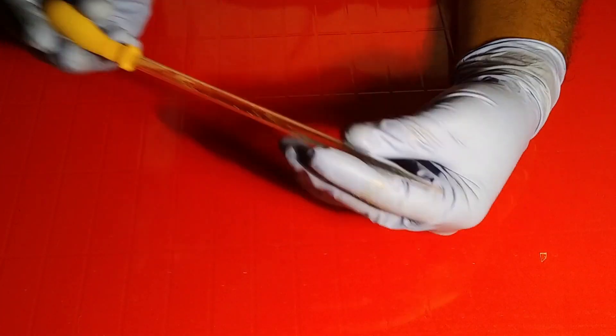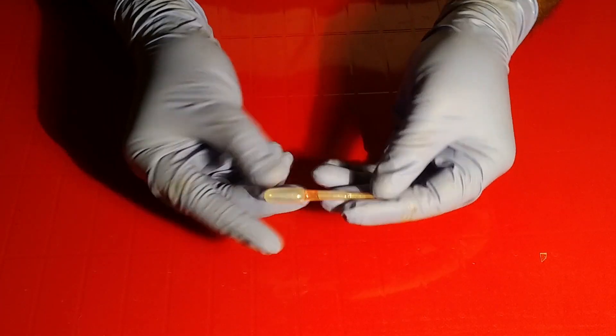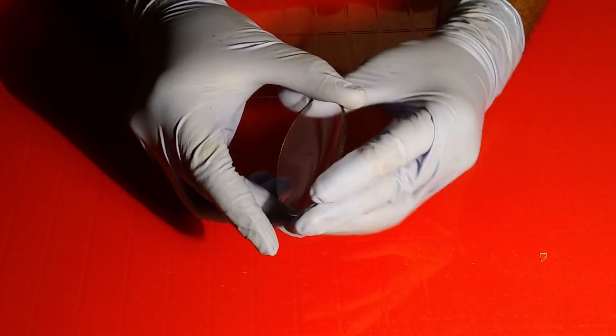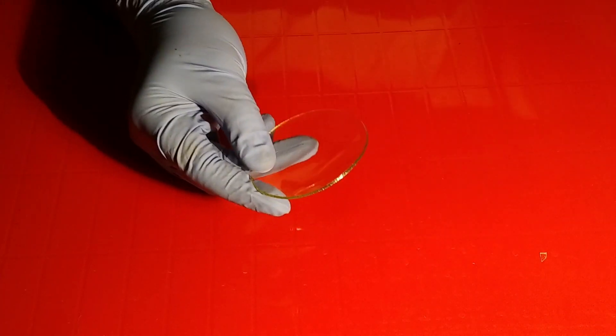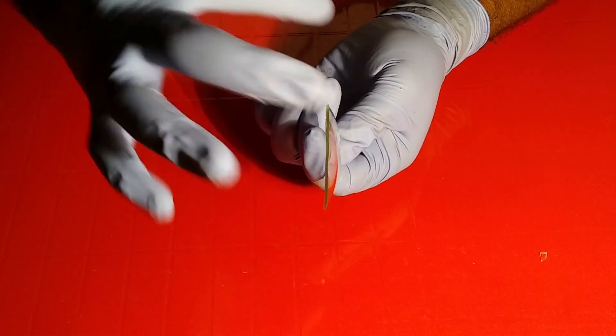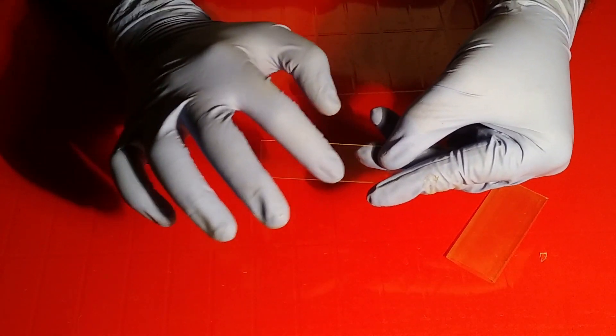Next is the dropper, which is used to put some stain or color dye. The next one is the watch glass — be very clear that this one is not plano-concave. Now we are just pouring some water onto it. Look at the area — it is not plano-concave.